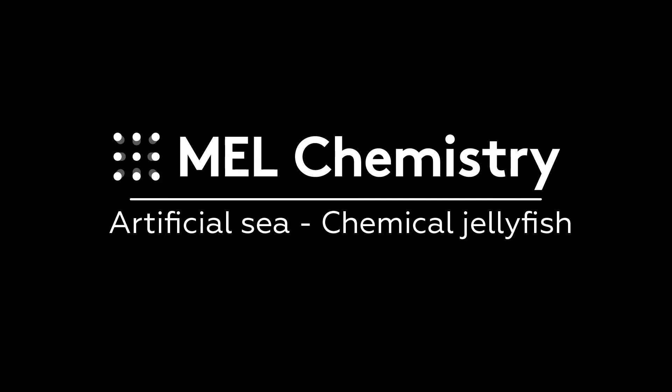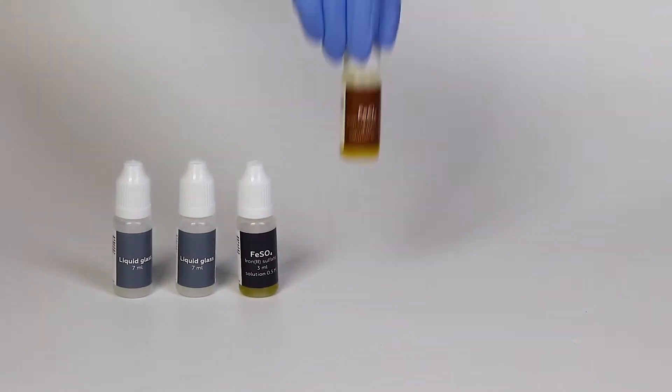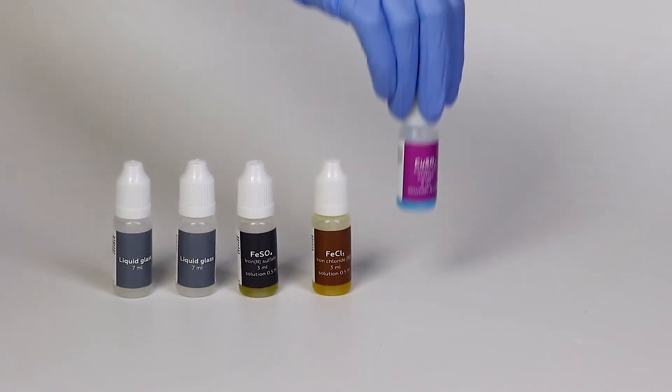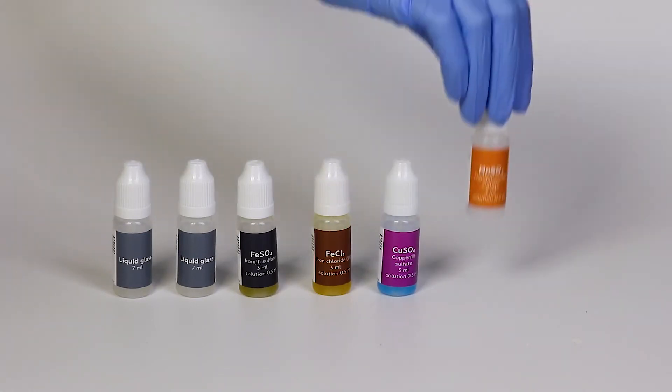For the chemical jellyfish experiment, you will need two bottles of liquid glass, the solutions of ferrous sulfate, ferric chloride, copper sulfate, manganese sulfate and a petri dish.